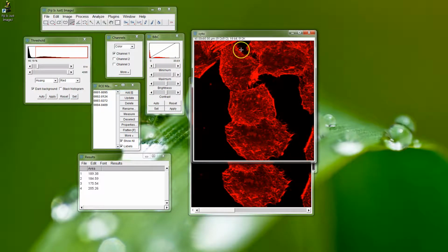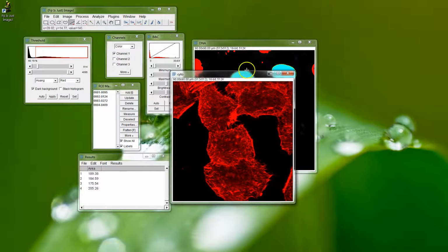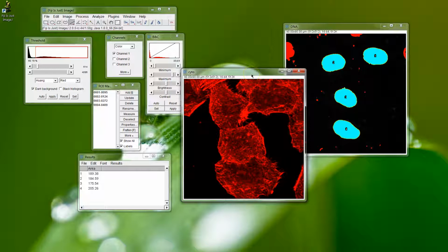Okay, right, so we're going to analyze the cell bodies now, and this is normally where I would lead off into Cell Profiler, and we'll come back to that, and we'll do a whole other line of Cell Profiler tutorials. Cell Profiler does a good job of starting from a seed point like a nuclei and working its way outwards.